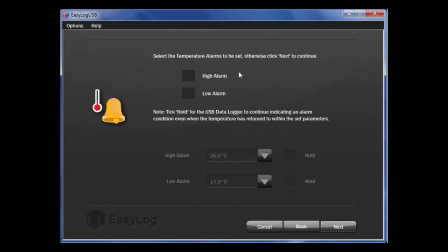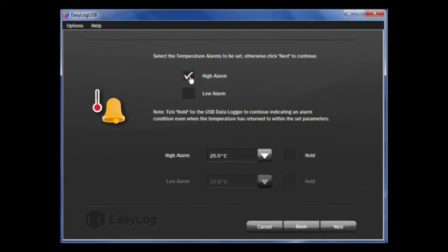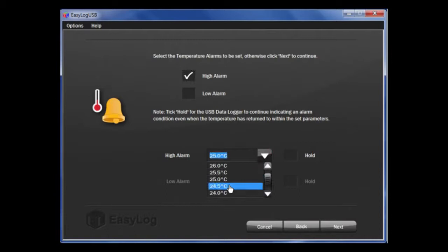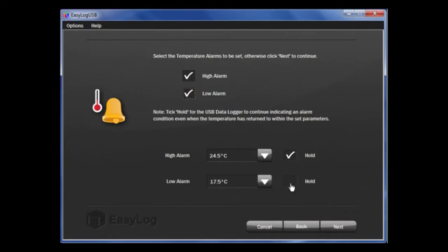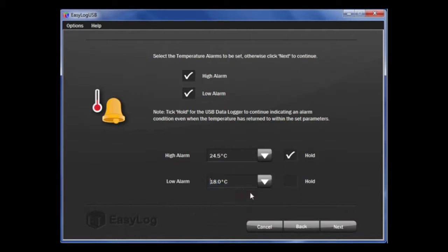The next page is alarm setup. You are going to set alarms for temperature, so click on the tick box here, which will allow us to set the high temperatures. Using the scroll down button here, choose the appropriate value. You will note to the right hand side that there is a tick box saying Hold. This is a feature that will continue to show an alarm condition even if the temperature has returned to a normal condition. I will do the same for the low alarm and select the appropriate temperatures. Then select Hold for both of them.